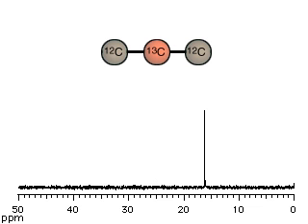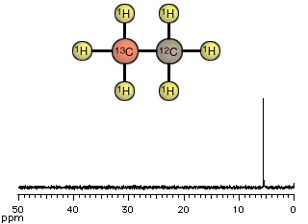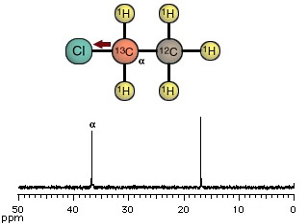Carbon chemical shifts are further affected by long-range effects caused by the other carbons in the molecule. Even non-adjacent carbons strongly influence the carbon-13 resonance frequency. An electronegative substituent not only de-shields the alpha carbon to which it is directly attached, but also, to a smaller degree, the beta carbon.